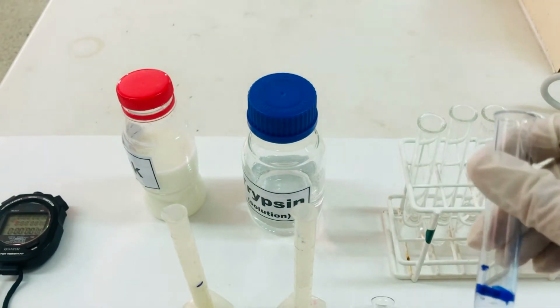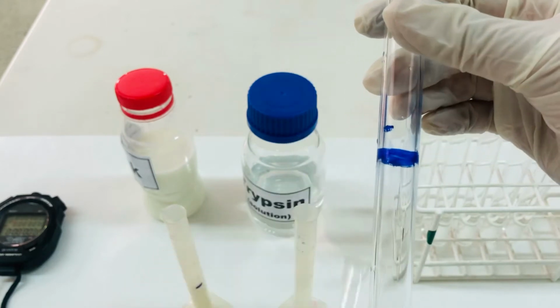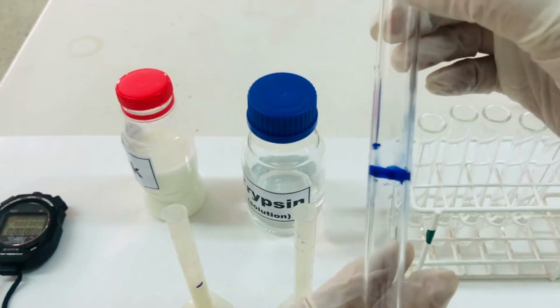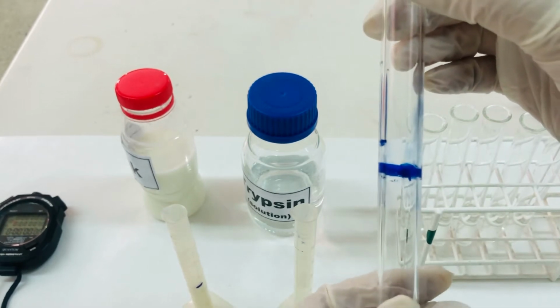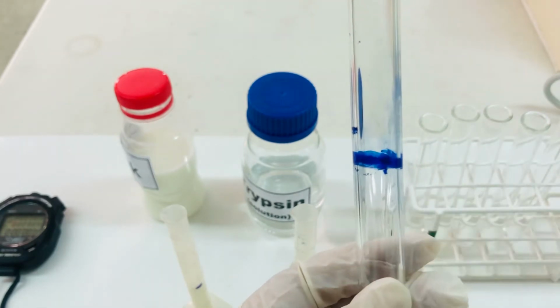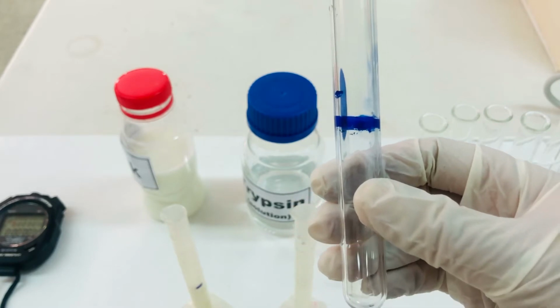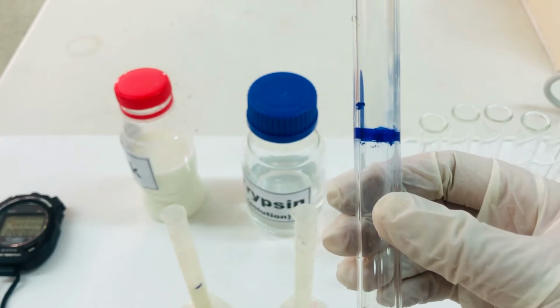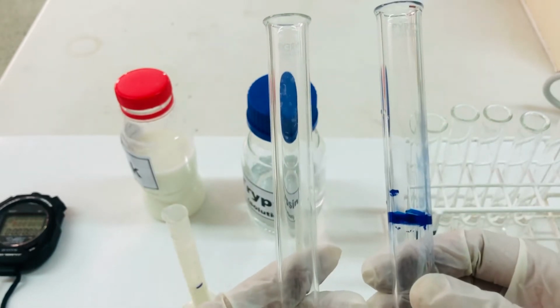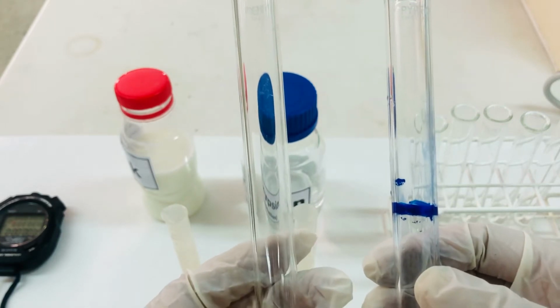To start the procedure, first of all, take two test tubes. In one test tube, make a mark approximately in the center of the test tube. You can make a ring mark or a cross mark, something to identify, and we are going to fill this test tube with 5 ml of milk. In the other test tube, which you can mark as T, trypsin, we will add 5 ml of trypsin.